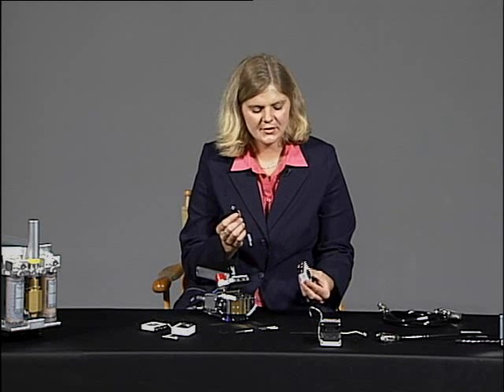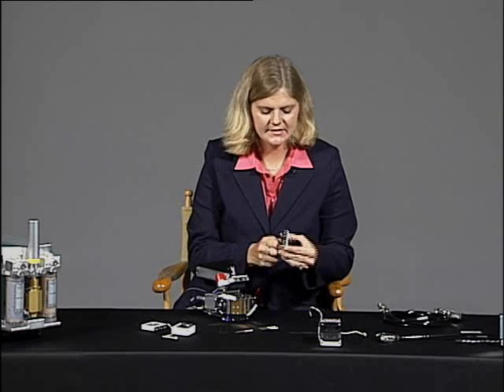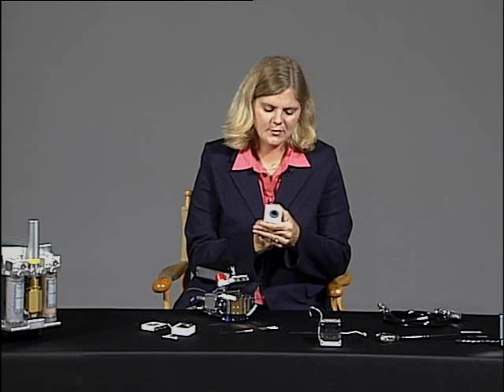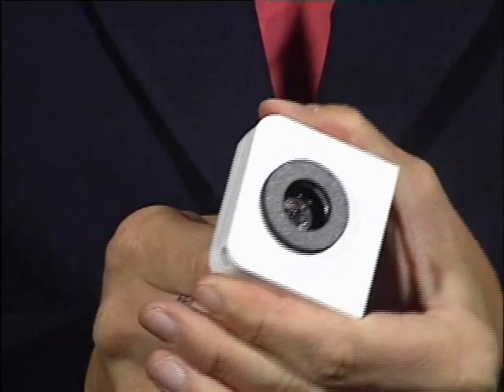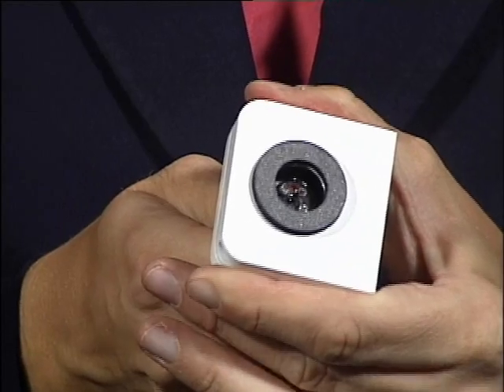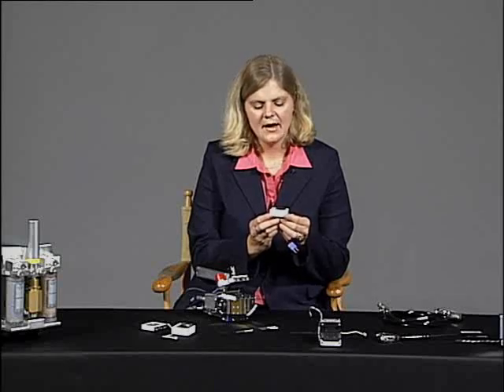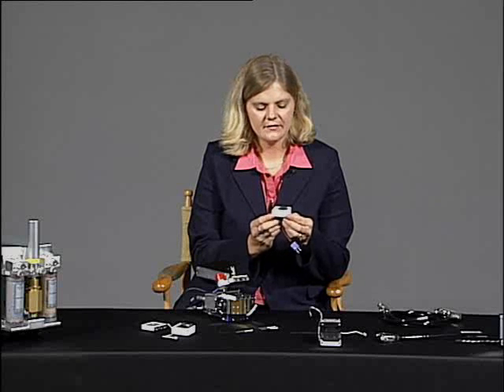To insert our thermocouple, simply push the thermocouple in the center. And now is a good time to align that thermocouple properly. You want to push up on the thermocouple until the bead of the thermocouple is about 1 millimeter above the surface of the gasket. And that will make sure that when your leaf is in the chamber, it will be touching the thermocouple.